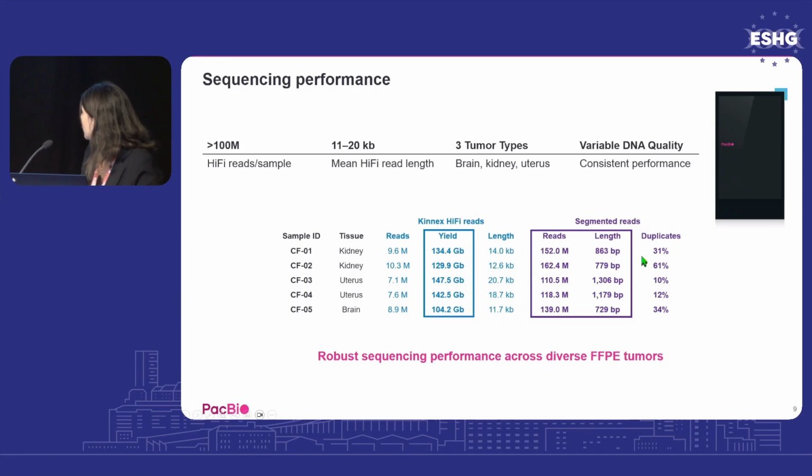And then the read length. It's normal to see a variation because this depends on the length of the DNA that we are extracting with the Covaris solution. But with that length, you will see that it's already very interesting in terms of variant analysis.